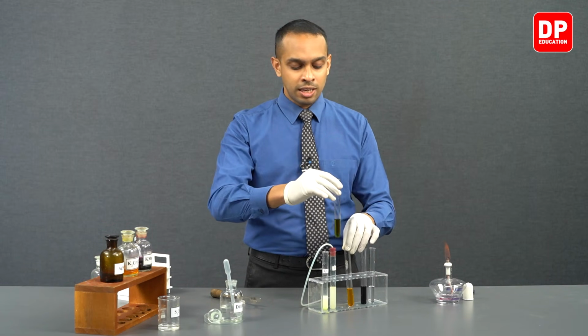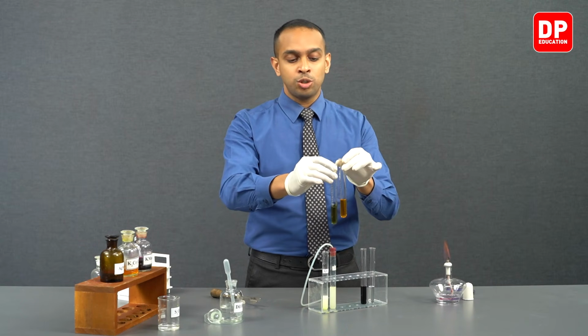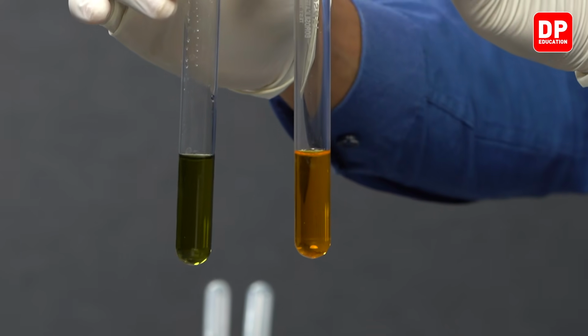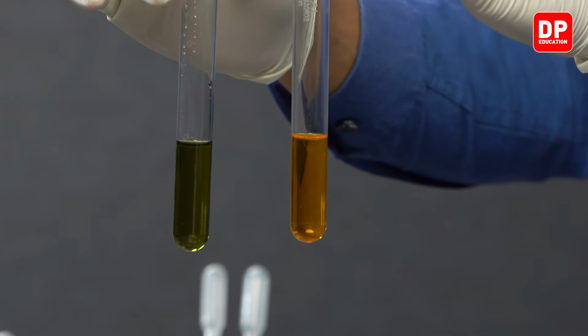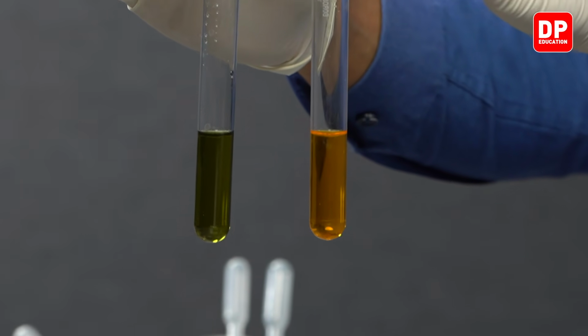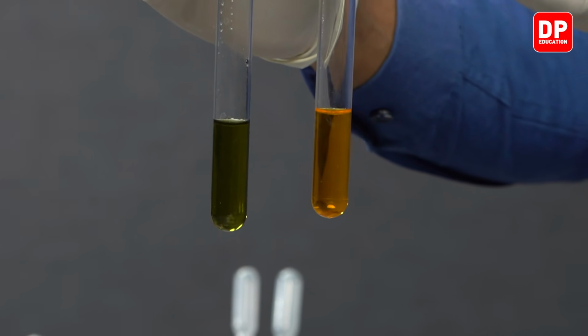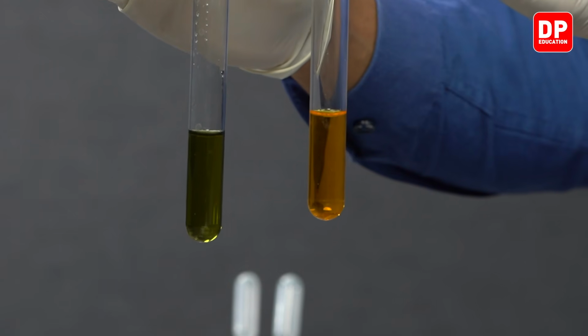And these are the color changes that you will observe when you send sulfur dioxide, produced when you react thiosulfate ions with hydrochloric acid, through acidified potassium dichromate solution.